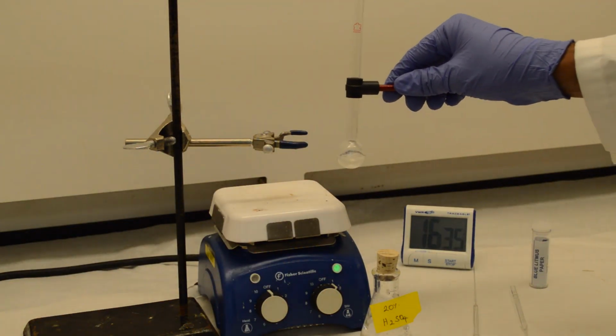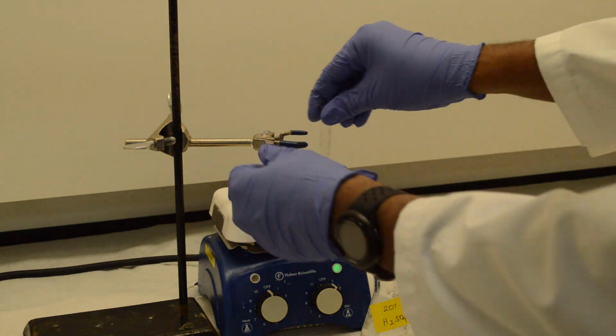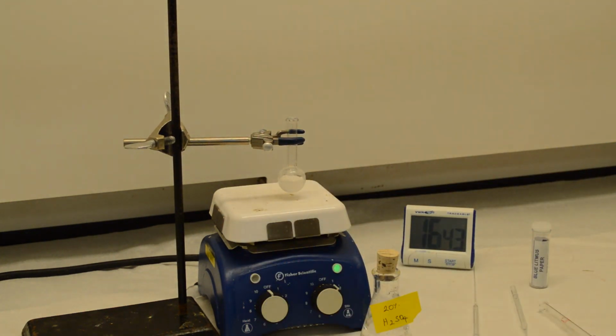Clamp your reaction mixture on a stirrer. Let it stir.